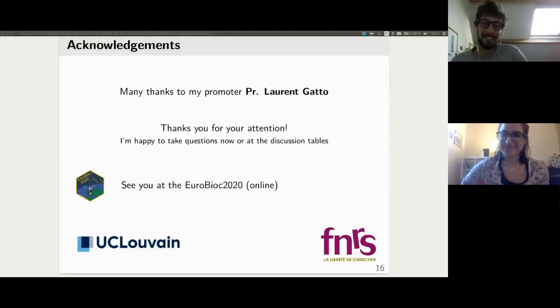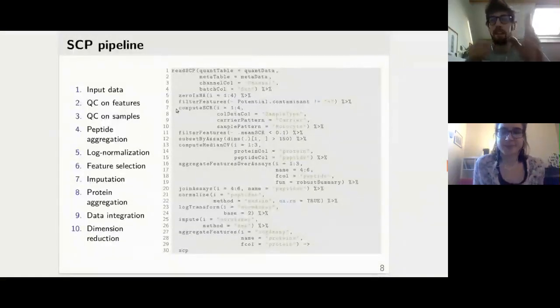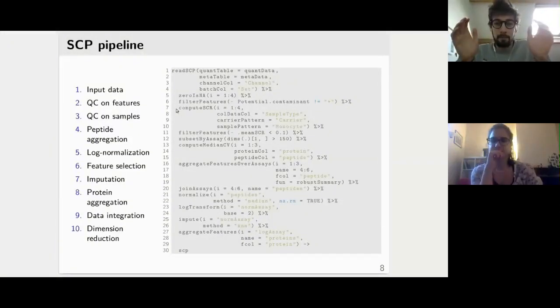For me, the biggest challenge was taking the existing analysis, where the whole R code was provided. This is very good, and by running their code I could exactly reproduce what they did. So on the reproducibility side, they did their job, but on usability and user friendliness, that was not the case. It took me a lot of time to actually understand what the code was doing, and then also convert it in a standardized, easy to understand, easy to read way in this package, and make it user friendly.